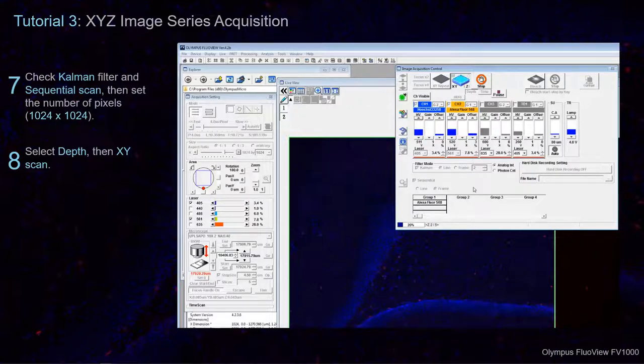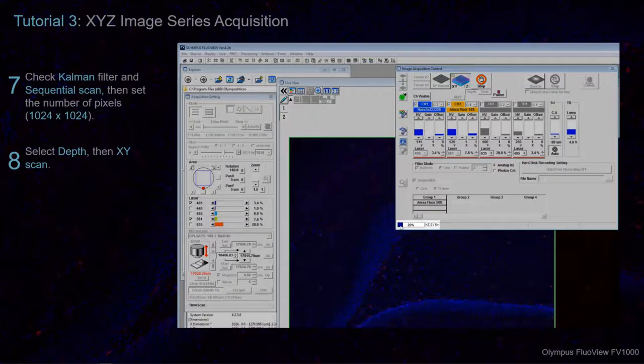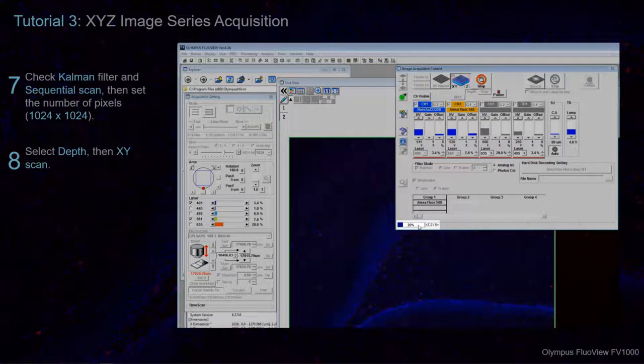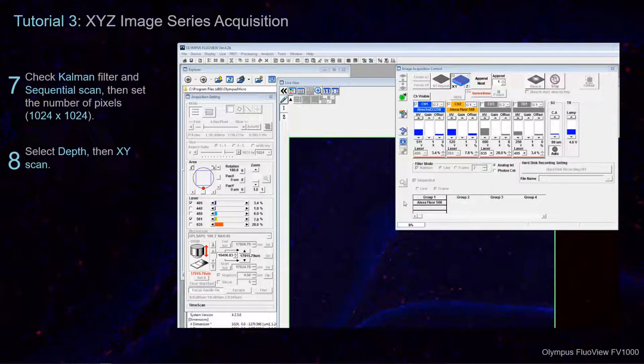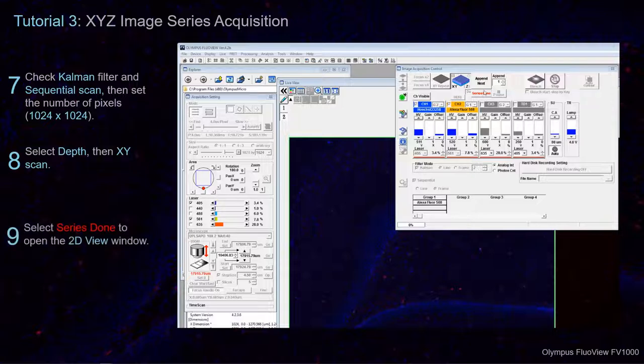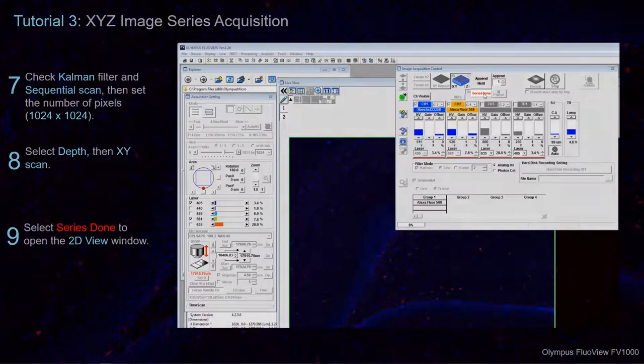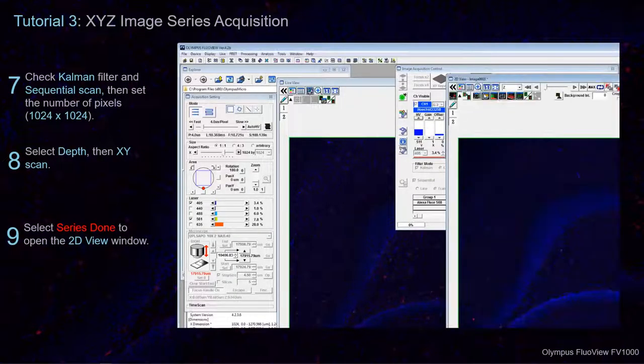At the bottom of the Image Acquisition Control window, you can see the acquisition progress in percent as well as in the number of steps that have been completed. When the acquisition completes, select Series Done. This opens the 2D View window.